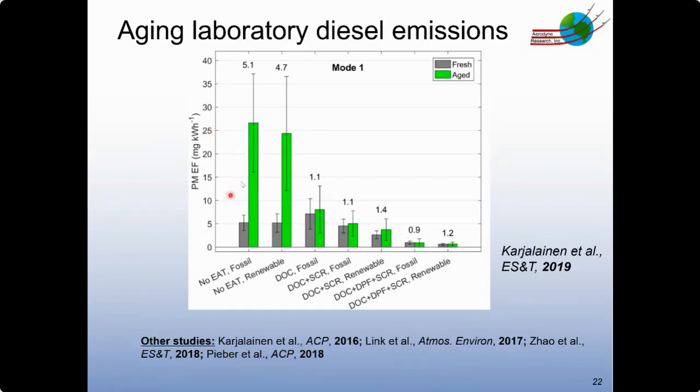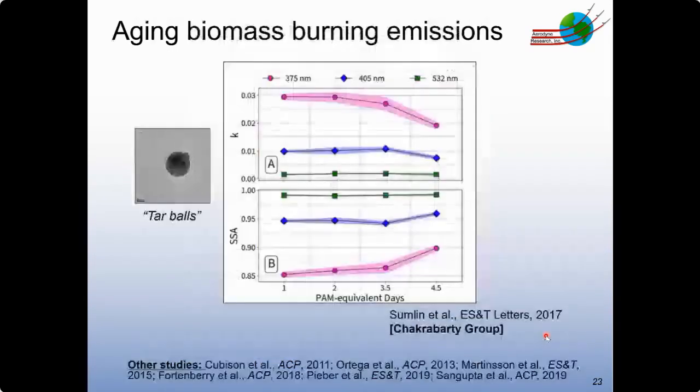So going from very high emissions to very low emissions, both primary and secondary, using specific combinations of engine aftertreatments and for different fuels. And there have been other studies in the literature that have also looked at these types of questions, but for different engines and also for other combustion sources, such as wood fires and even single vehicles on dynamometer studies. So this is a very common application of OFRs.